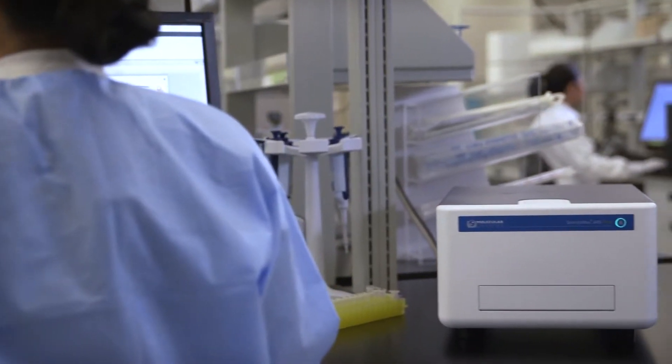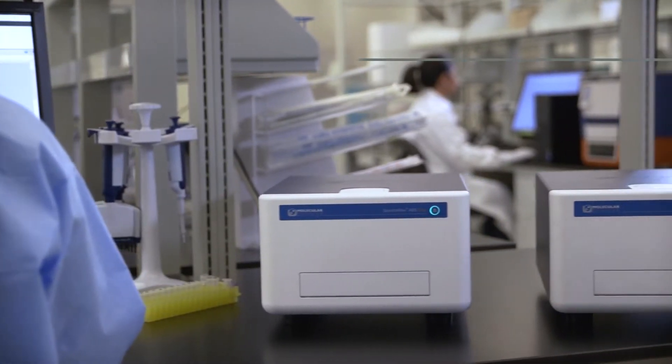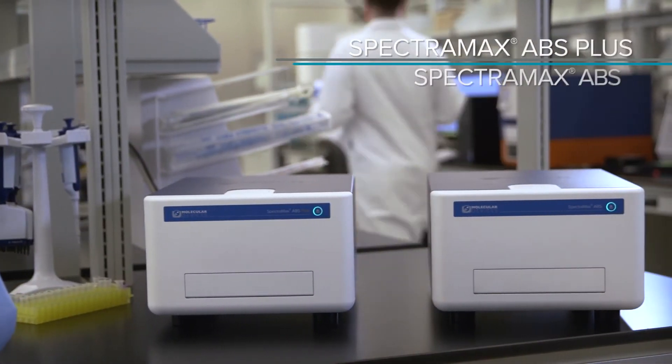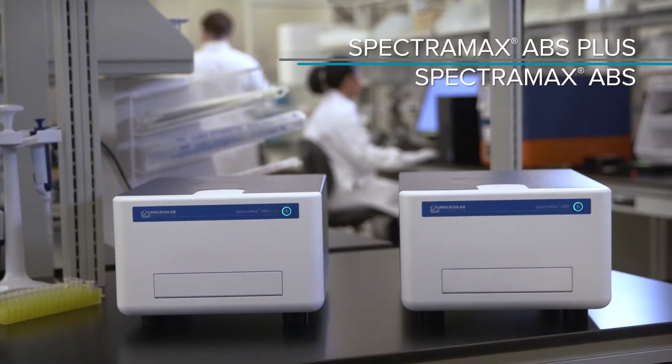The newest microplate readers from Molecular Devices, the SpectraMax ABS Plus and ABS, are built to fit into your lab and your budget.